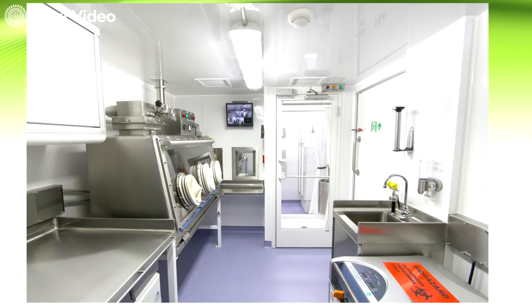This one. Okay, so meron kang anteroom, nakikita mo, yung pintuan dyan, na parang may kwarto pa sa labas, that is the anteroom. Hindi ka basta-basta makakapasok sa lab. So, meron ka muna ng isang room, bago ka makapasok sa mismong lab room. Ito yung kanyang lab room na. 'Di ba? And then sa labas niya may anteroom, tas may pintuan pa sa labas. Okay? That is an example of a level 3 lab. And then yung kanyang air diyan sa loob, controlled yan. Makikita mo may mga ventilation system. And then yung lumalabas na hangin, tsaka pumapasok na hangin is actually clean. Merong mga HEPA filter diyan for the air.